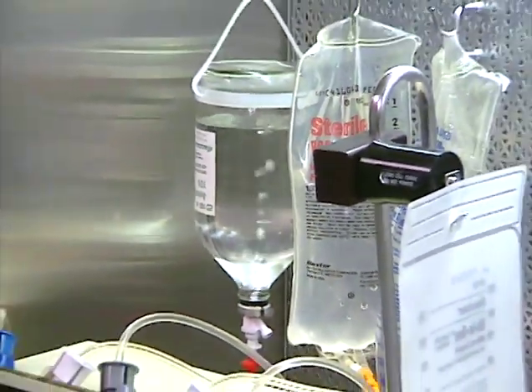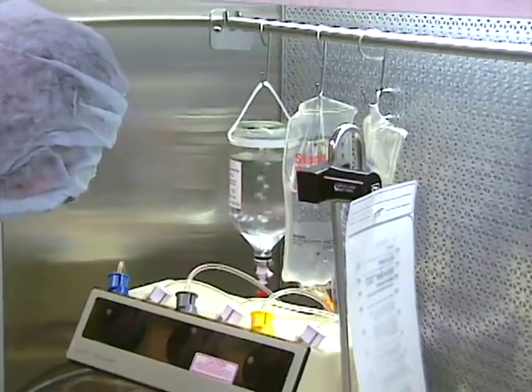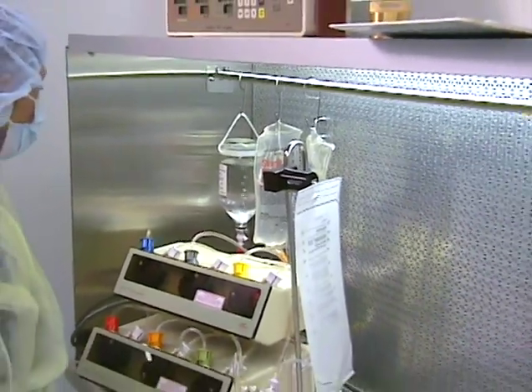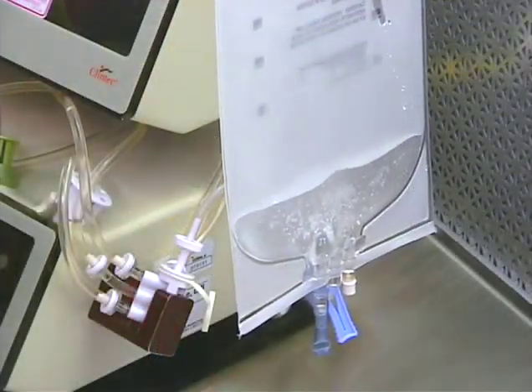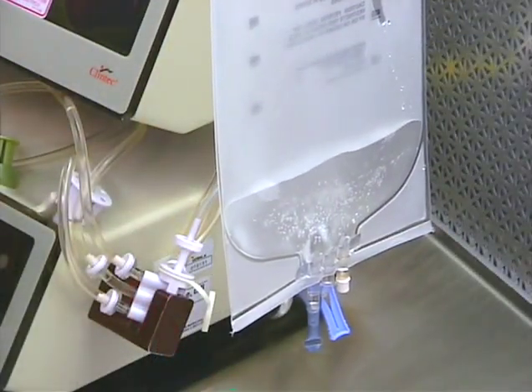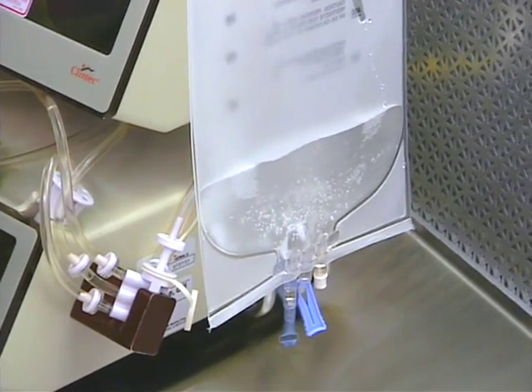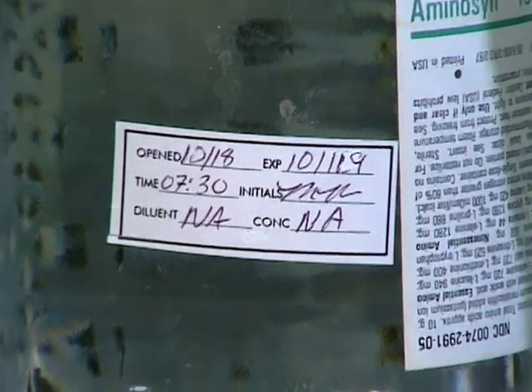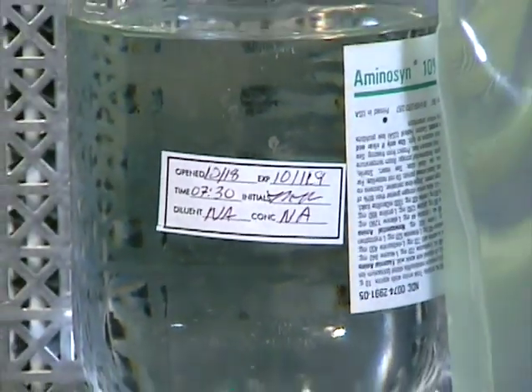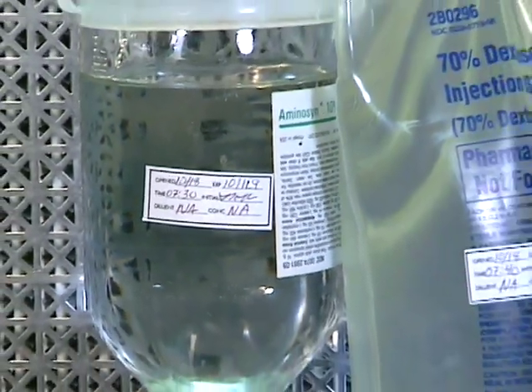The operator should note the approximate volume in each source bag prior to starting the pumping procedure, and, upon completion of pumping, verify that the correct volumes were pumped. Following initiation of compounding, the final container must not be disturbed in any way. Compounder source solutions and hanging bottles or bags of diluent should have a sticker attached, listing the date and time of opening and the operator's initials.